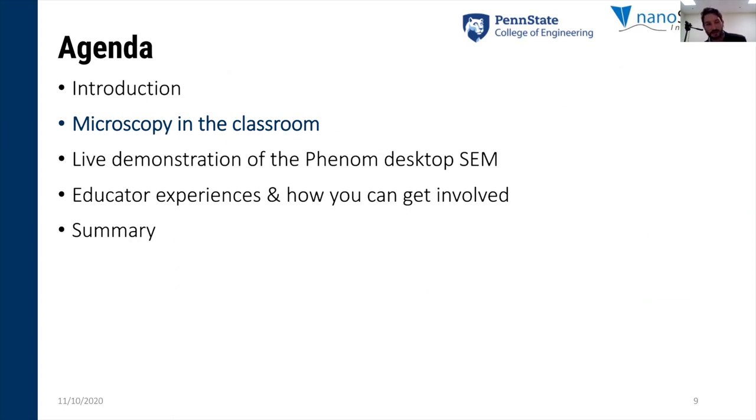The first thing we're going to talk about today is microscopy in the classroom, kind of as we know it. And then I'm going to actually show you a scanning electron microscope live. And not only am I going to show it to you live, I'm actually going to remotely control it from my laptop, just to show you how easy it is to remotely control this instrumentation.